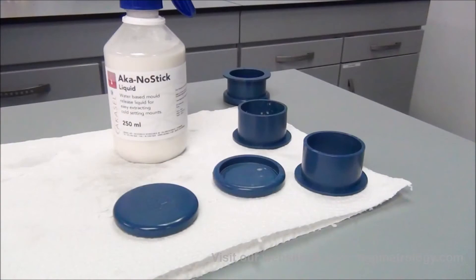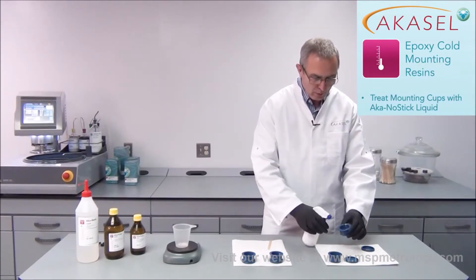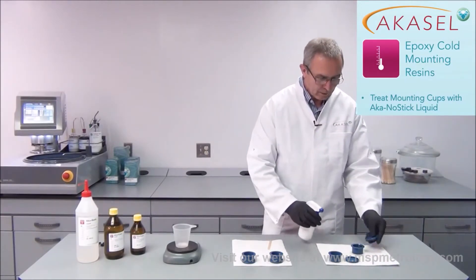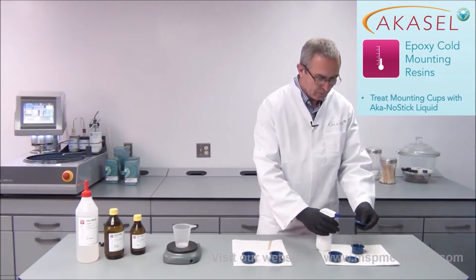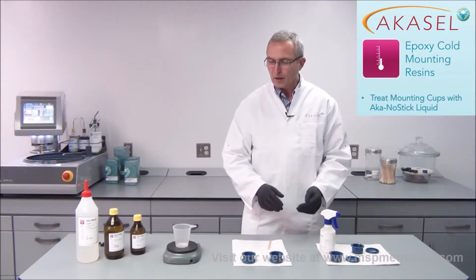Before we start mounting our samples, we have to prep our mounting cups. We have the Aka-NoStick liquid that we use to spray our mounting cups with — both parts — because then the epoxy resin doesn't stick in the mounting cups.